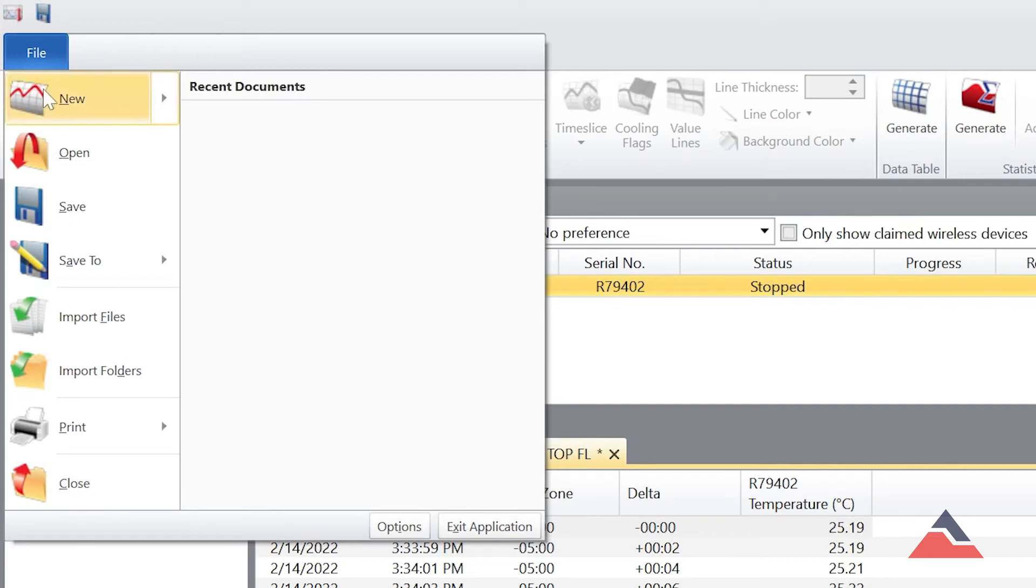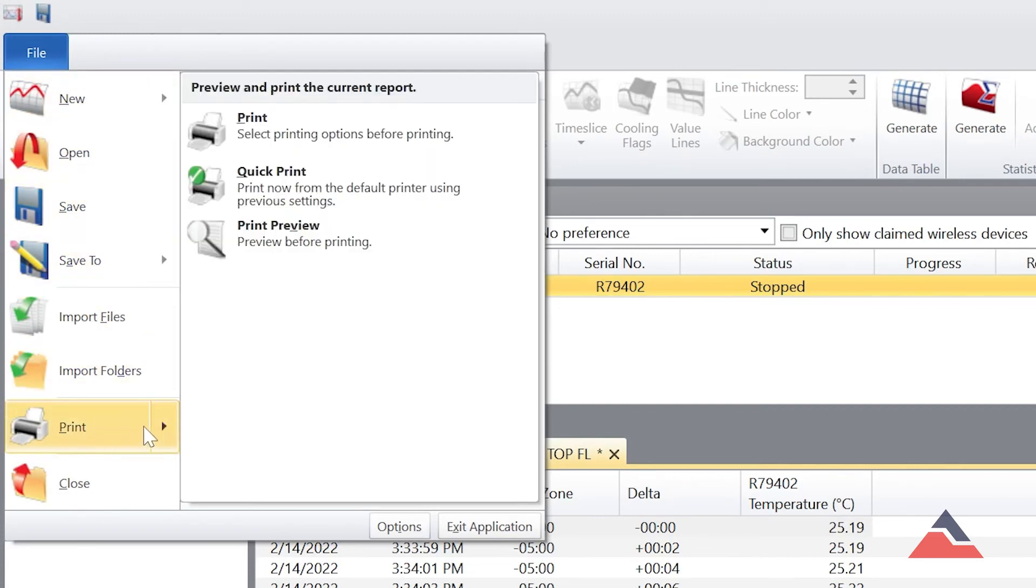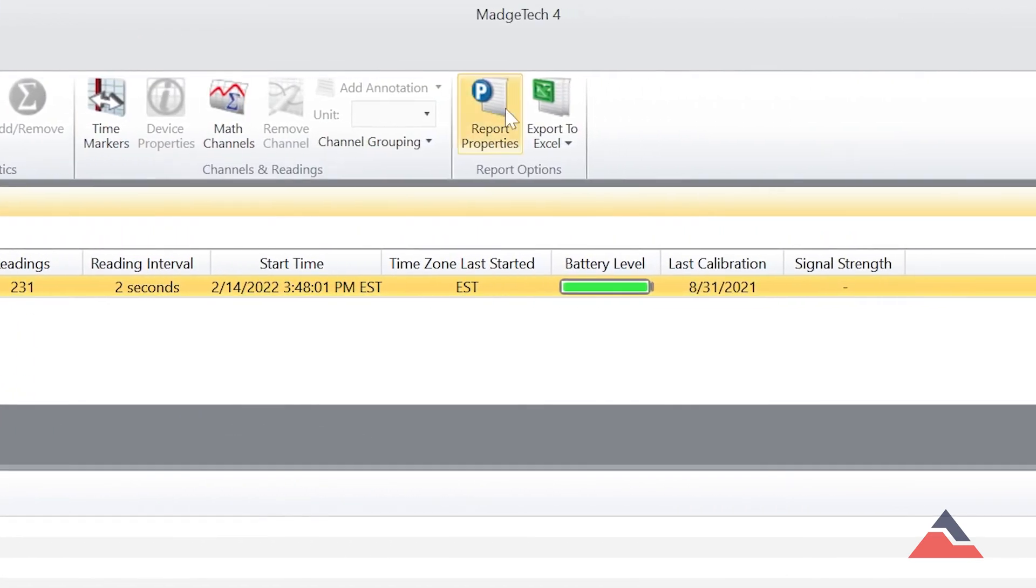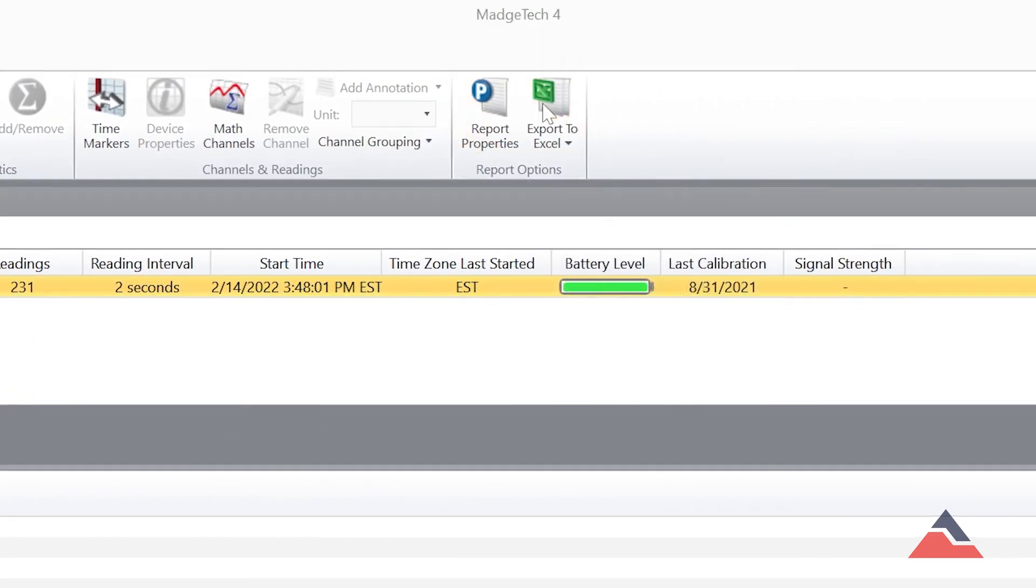To print a report, first make sure the correct report is opened and select Print under the File tab. To export to an Excel document, in the Report Options section, select Export to Excel.